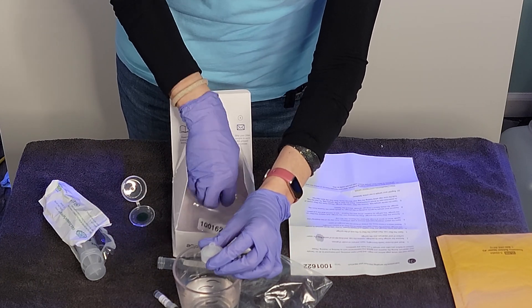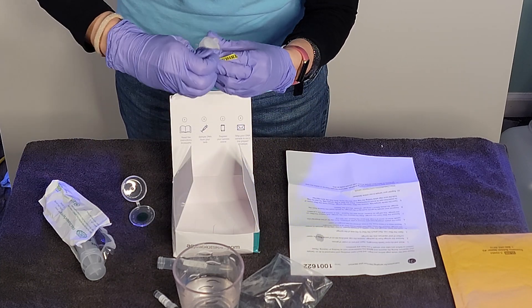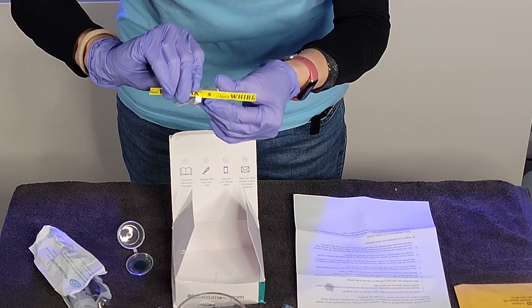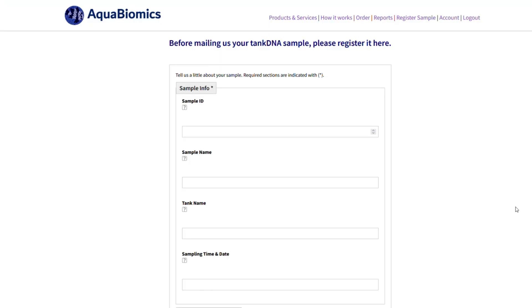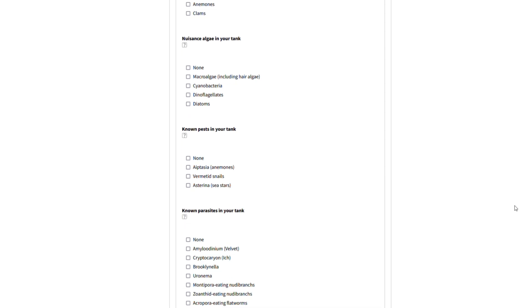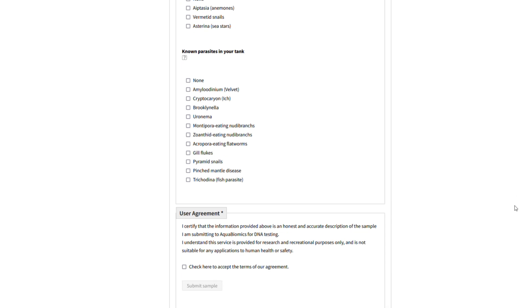Now we are going to take the last thing in our box — this little sterile bag — and put our sample in it. We're going to twist this end over end twice and then press these yellow tabs in. The next thing we have to do is register it on their online database and then send it in. Timing is really important: it shouldn't be more than 24 hours from when you take your samples to when you put them in the mail. If you have to do your samples early and can't mail them, you can stick them in the freezer and store them until you're ready.